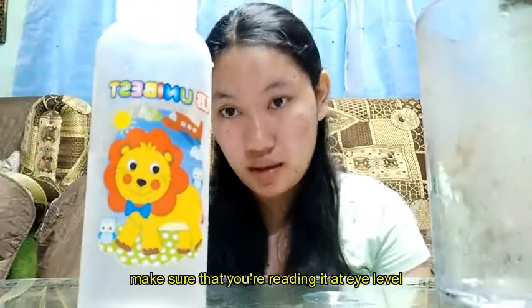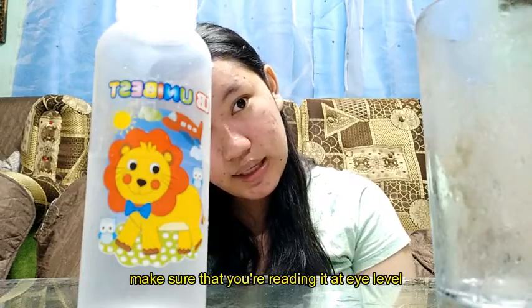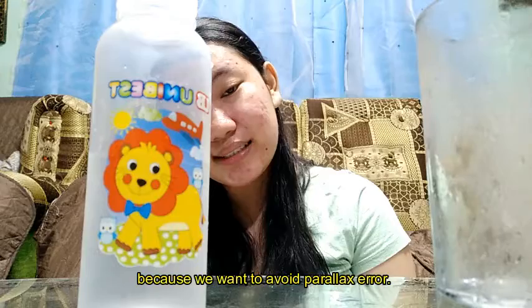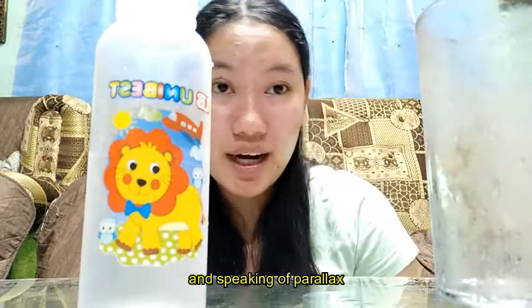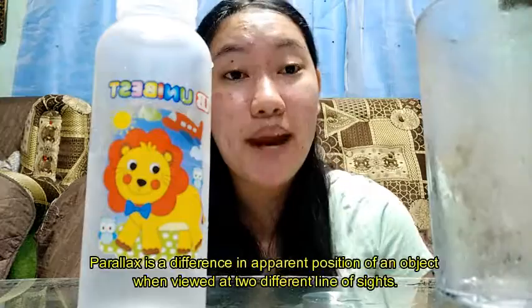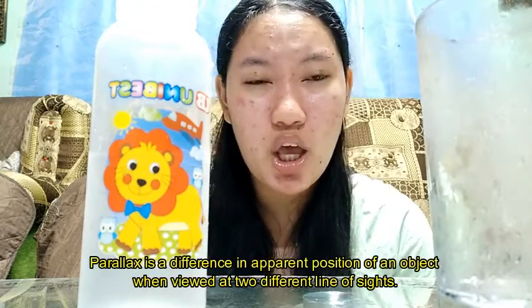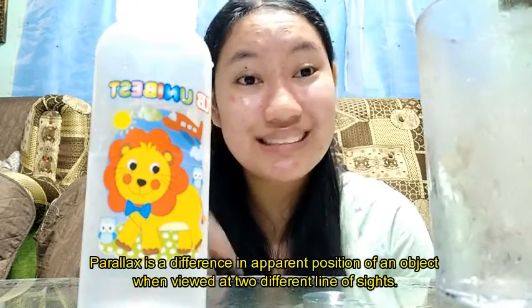When you read it, make sure that it's at your eye level because we want to avoid parallax error. Parallax is the difference in apparent position of an object when viewed from two different lines of sight. That means you could get the wrong measurement when you view it not at eye level.